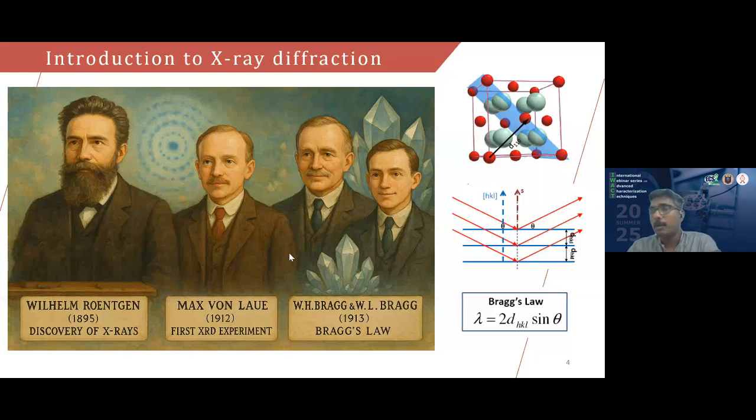With the advent of technology as well as instrumentation, it led to the development of high resolution XRD, which plays a very critical role in analyzing epitaxial thin films, polycrystalline thin films, surface layers, etc. Today, XRD plays a very important role not only in crystallography but also in chemistry, material science, nanotechnology, and biosciences, allowing scientists to design new materials and to study the properties of materials at an atomic level.